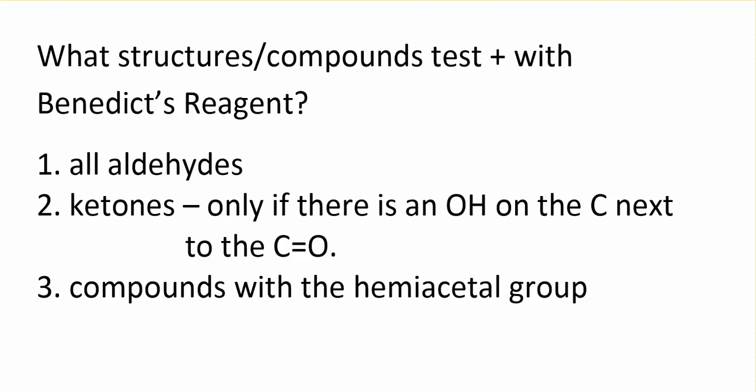What does it take for a positive test? Well, all aldehydes will cause a positive test, and ketones will if there is an OH next to the carbonyl carbon. And so for both of those reasons together, all monosaccharides should test positive unless they're some kind of funny deoxy where it was missing this one. But anyway, pretty much all typical monosaccharides would test positive with those two.